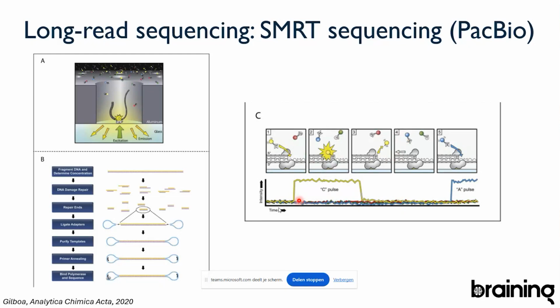The strength of PacBio smart sequencing is that you sequence this molecule over and over and over. The first time, the DNA polymerase is going to make a number of errors, right? Biology is not perfect, so the DNA polymerase will sometimes include a base that's not the correct one, right?